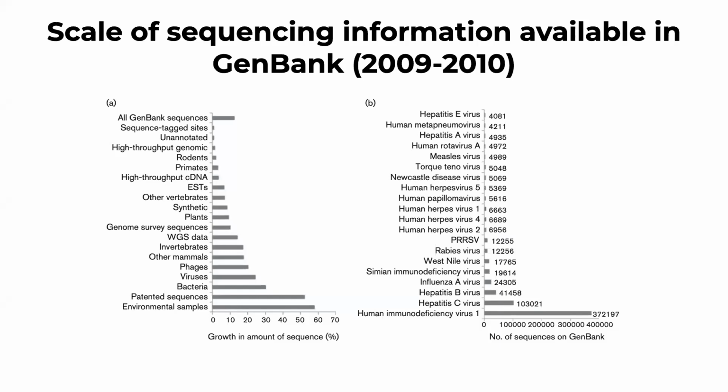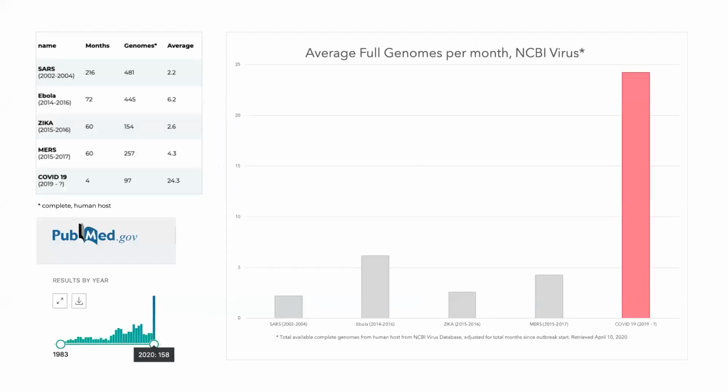If you take a look, we did a study in April on how many sequences were submitted for the coronavirus COVID-19. So in our study, we identified that the different recent outbreaks in these viral infectious diseases have been sequenced in tremendous amounts, starting from the Ebola outbreak in Africa. So in fact, next generation sequencing has been applied to a variety of different viral studies, but the most use of these has been associated with pandemic outbreaks.